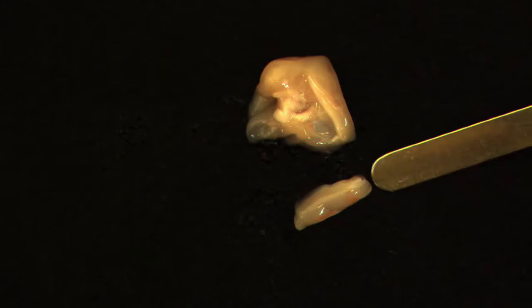The tissue is now ready for subsequent biochemical experiments or RNA extractions.